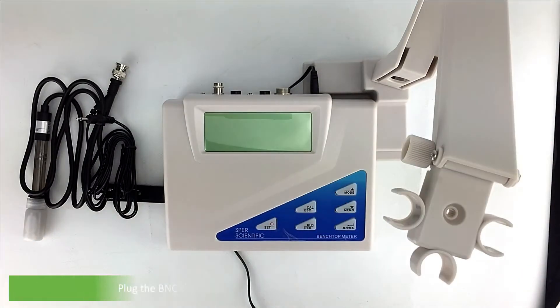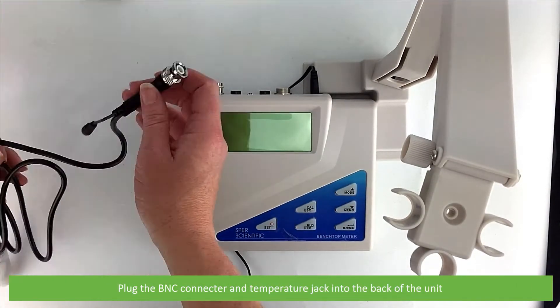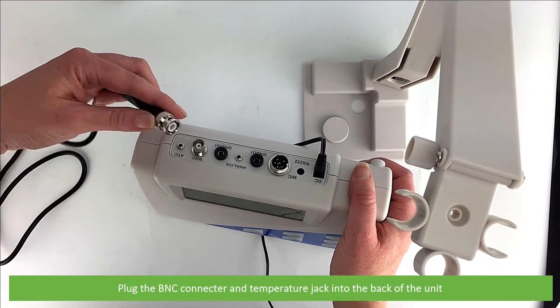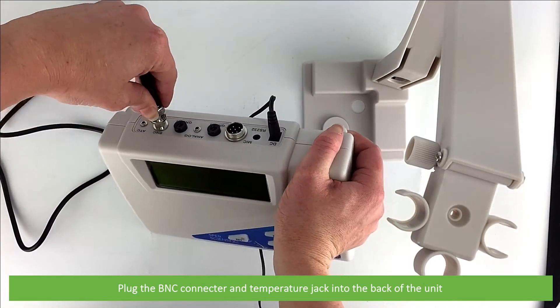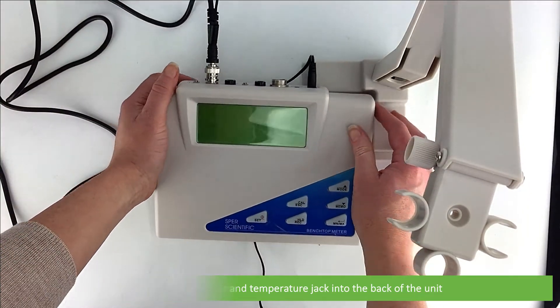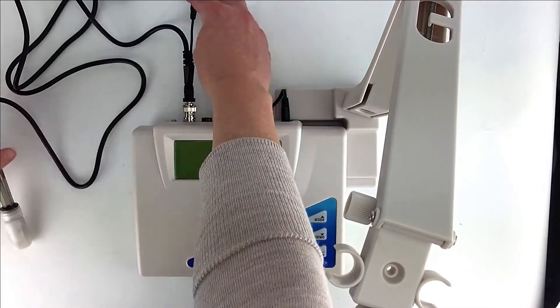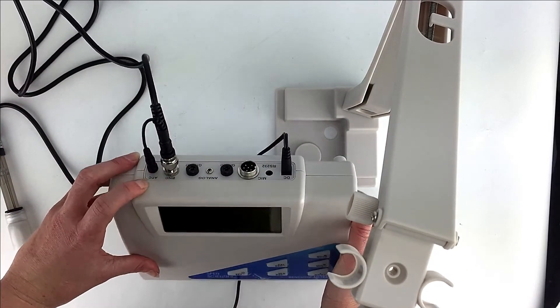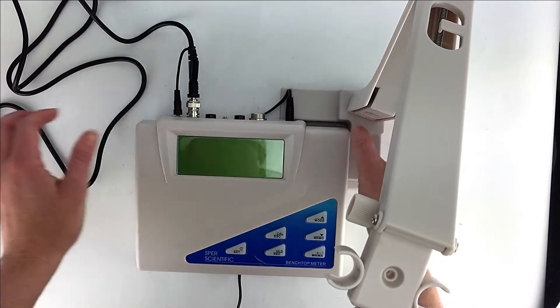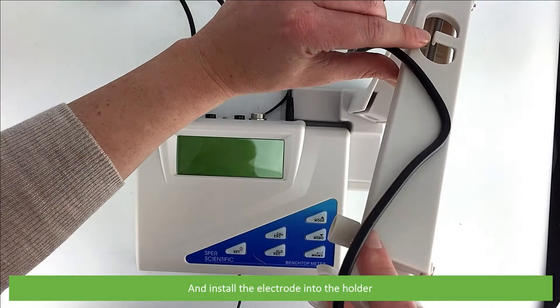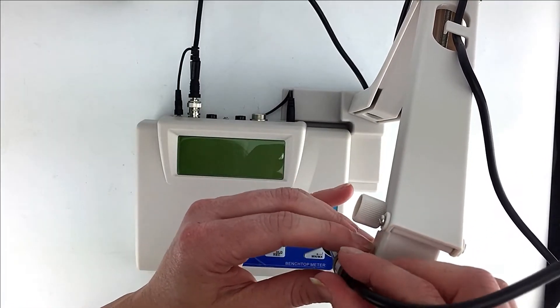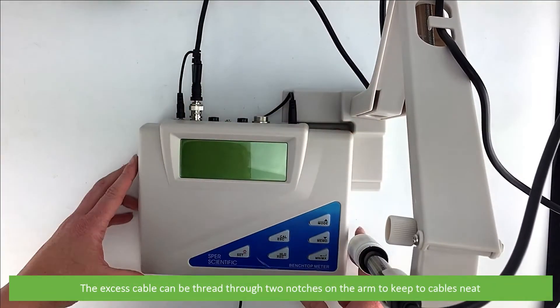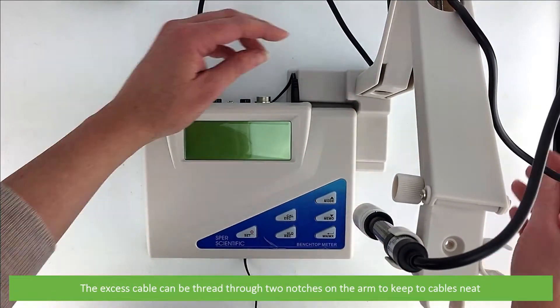Plug the BNC connector and temperature jack into the back of the unit, and install the electrode onto the holder. The excess cable can be threaded through the two notches on the arm to keep the cables neat.